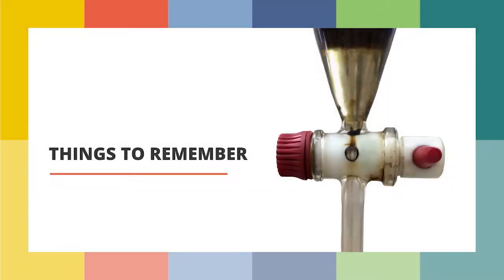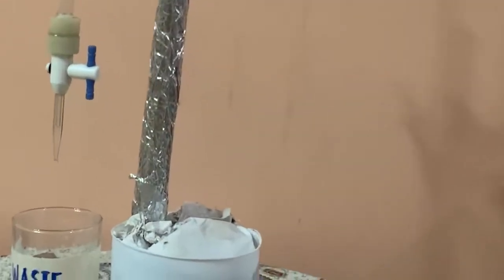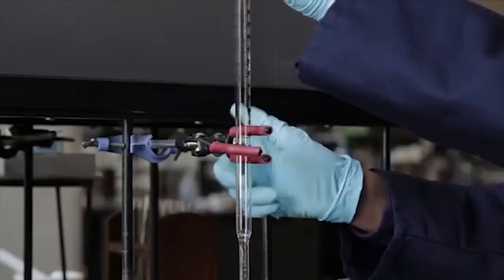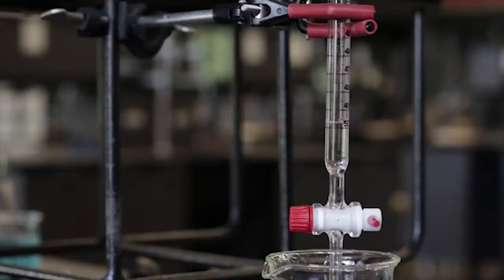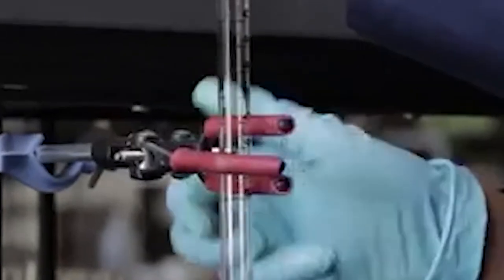These are the things to remember when setting up a burette. First, we have to secure the stand on the base on a flat and sturdy surface. Second, the burette must be put in the upright position of the burette clamp. Third, when reading a burette, it is important that your line of sight be in a perpendicular direction to the burette column. Lastly, make sure that it is tightly fitted to avoid slipping and breakage of the burette itself.